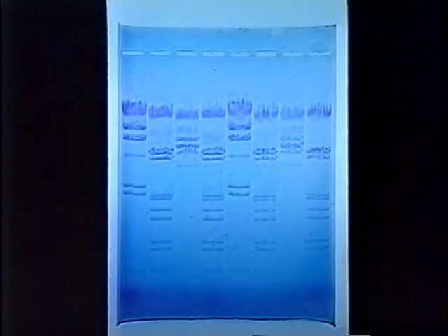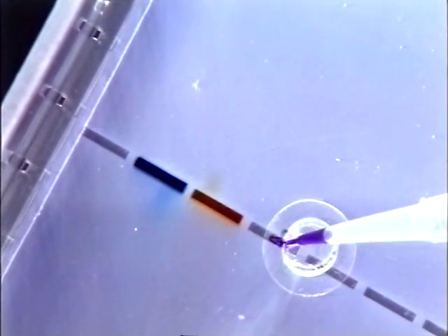Macromolecules can be visualized through the techniques of gel electrophoresis, a process that separates them, revealing their overall structure and size. Colored dyes can be used to illustrate the principles of electrophoresis.